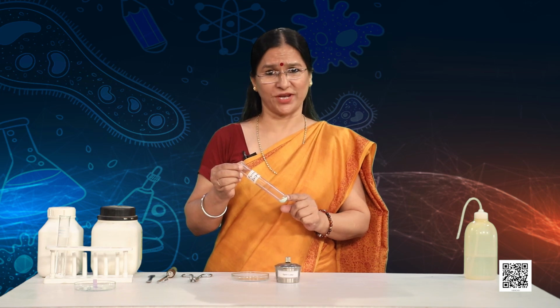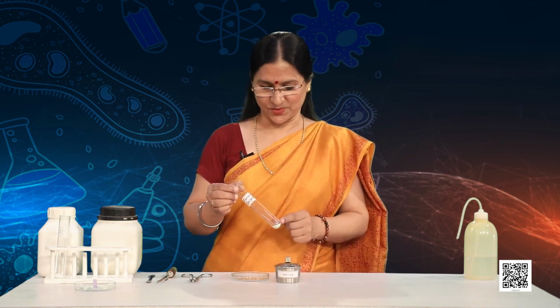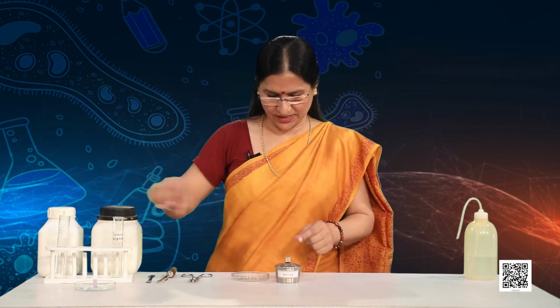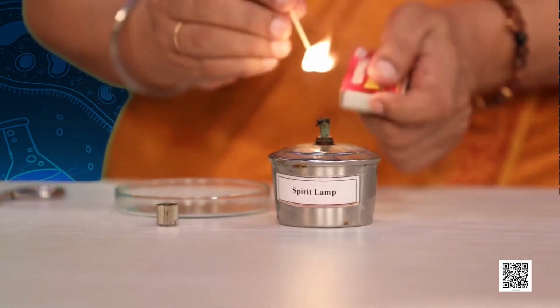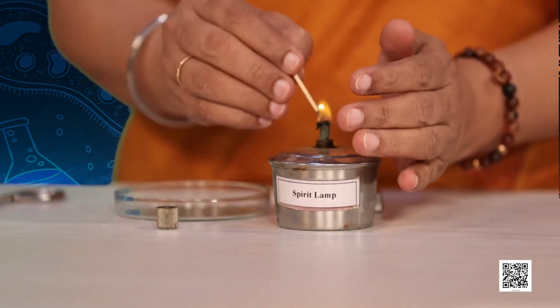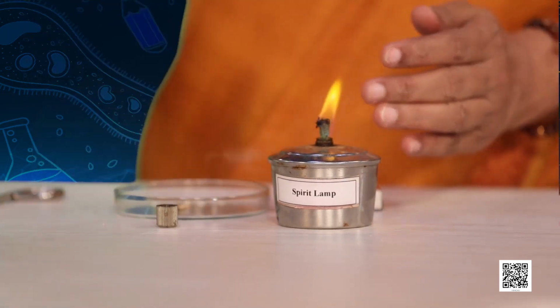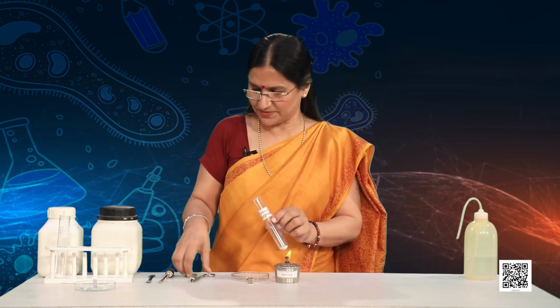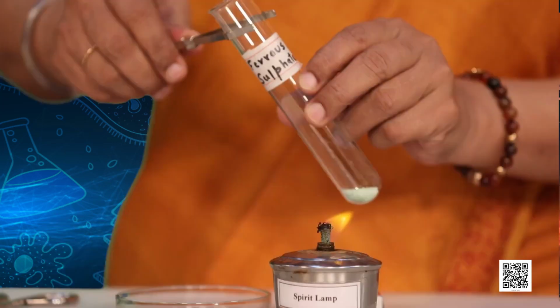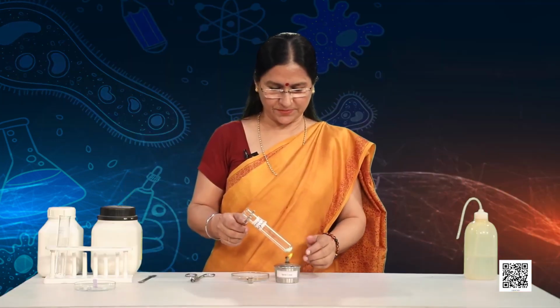Now let's heat the boiling tube over the flame of a spirit lamp I have here. Well, first let me light the spirit lamp. Whenever you are doing such experiments, make sure you are doing under the observation of teacher. So here is the boiling tube with ferrous sulfate crystals. Let me hold it with the test tube holder and now place it over the flame.